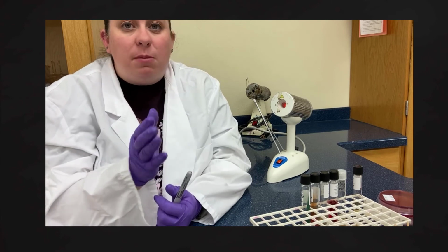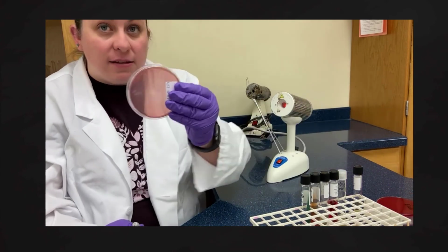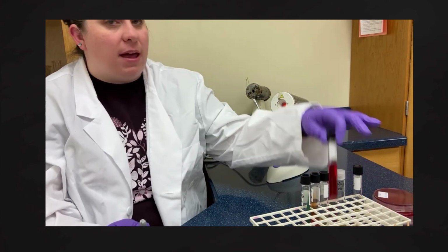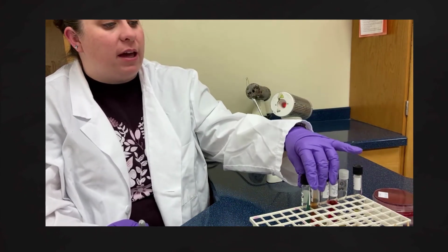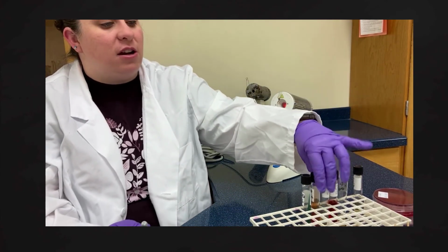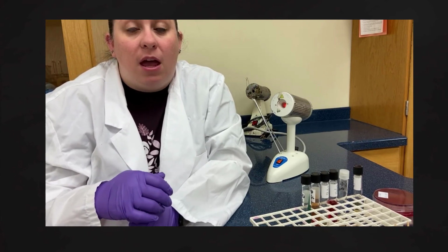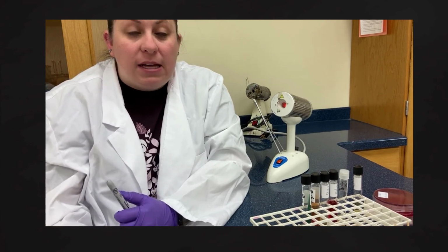But the whole point in this part of the lab was just showing you how you can inoculate different types of cultured media, whether it's a plate, or a broth, or if we look at here, a deep or a slant. All right, and so this allows us to see that there are different ways that we can inoculate this type of material in the lab. If you have any questions, please let me know.